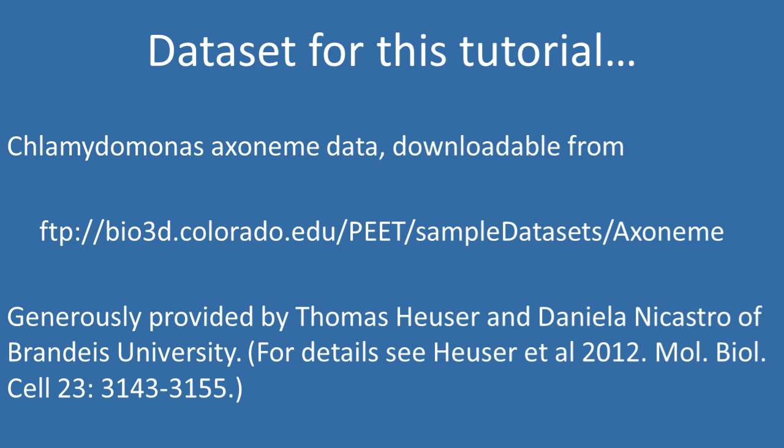Throughout the tutorial, we'll use Chlamydomonas axoneme data kindly provided by Tom Heuser and Danny Nicastro of Brandeis University. These data can be downloaded from the URL shown on your screen. For further details, please see the Heuser et al. 2012 article shown there.